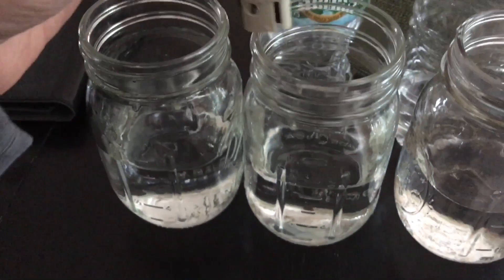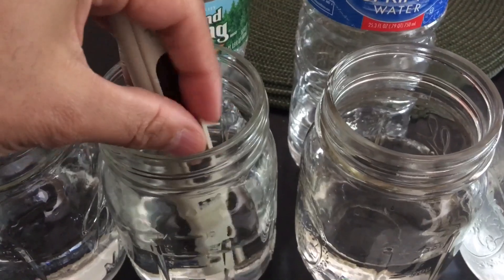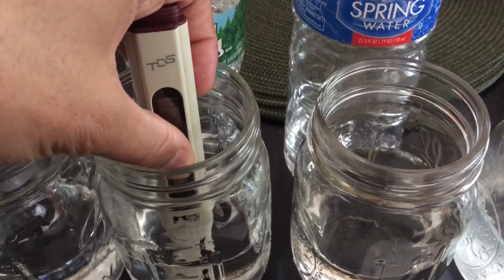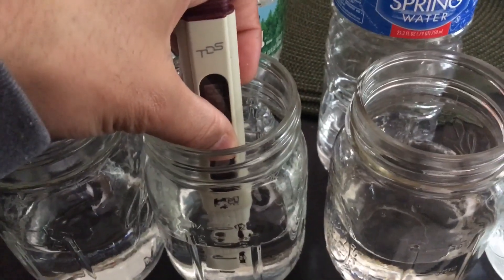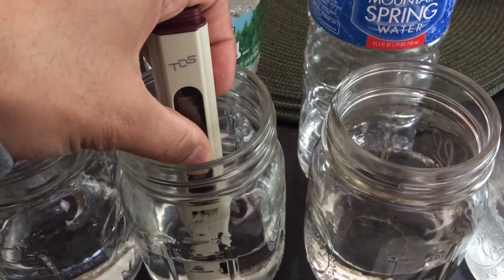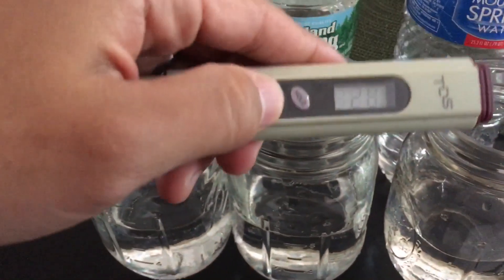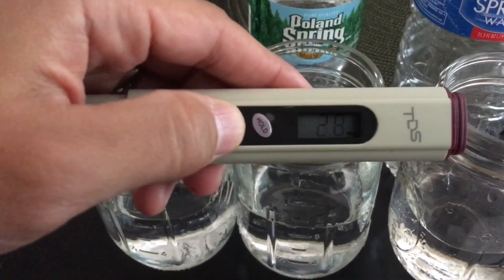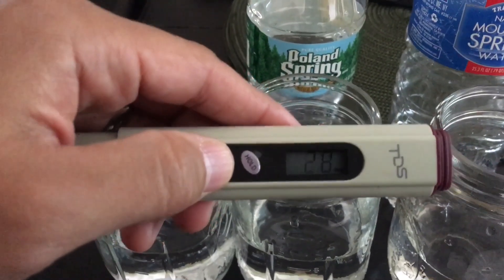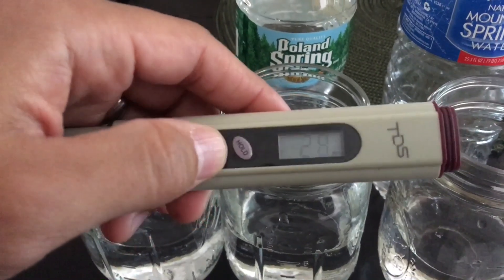Now we're going to test the Poland Spring water and see what readings we get. We hold the meter in there for a couple of seconds, making sure it gets a good stable reading without fluctuating. From 163 ppm for my municipal water, we're getting much closer to zero — it's 20 parts per million for Poland Spring. Not bad; it's decent water, at least for human consumption.